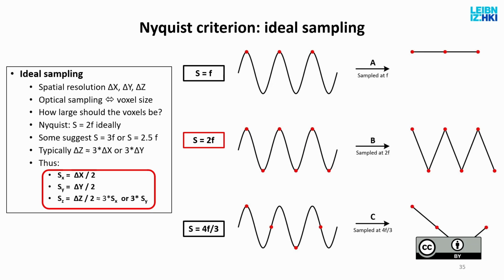Now, let's say your microscope is good enough so you can resolve 200 nanometers in terms of spatial resolution. If you then have collected your images in such a low resolution that each image point, each pixel, is 500 nanometers, can you resolve this 200 nanometer object? You cannot, because the pixel itself is bigger than the resolution of the microscope.